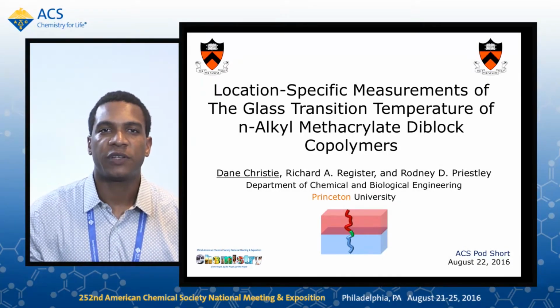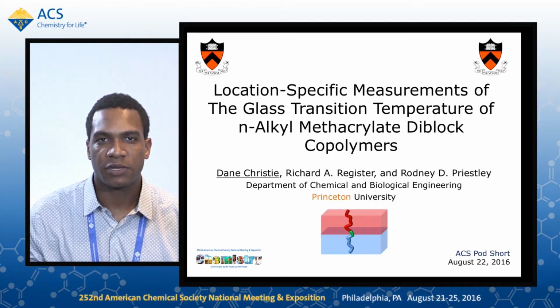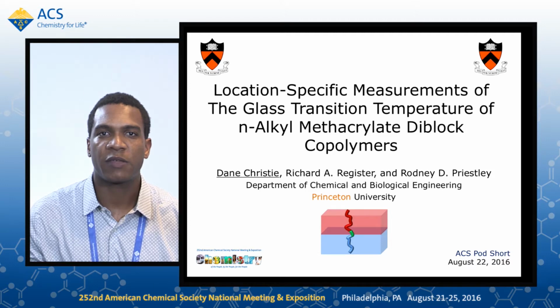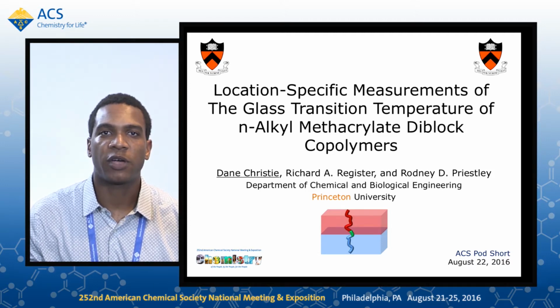I'm a graduate student in the Department of Chemical and Biological Engineering at Princeton University, and today I'd like to share some of the work that I've been doing with you at Princeton. So the focus of my thesis is to characterize the distribution of glass transition temperatures across the domain period of lamella-forming diblock copolymers, and I plan to do so using fluorescence spectroscopy.